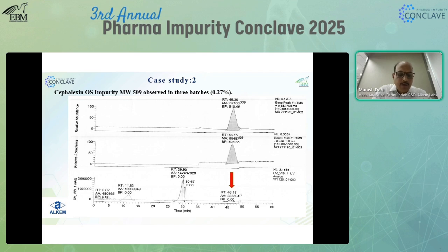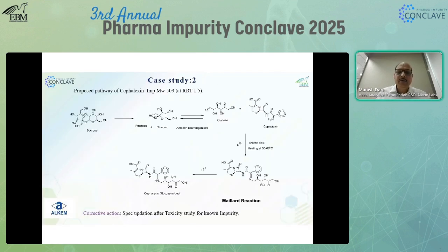After complete investigation and hypothesis performed at QC, they were not able to identify the source and how it increased in this particular batch. Then R&D supported the identification of this impurity, and we performed mass analysis on this particular sample and identified that the impurity mass would be 509. Based on the 509 information, we predicted what kind of impurity would be present.